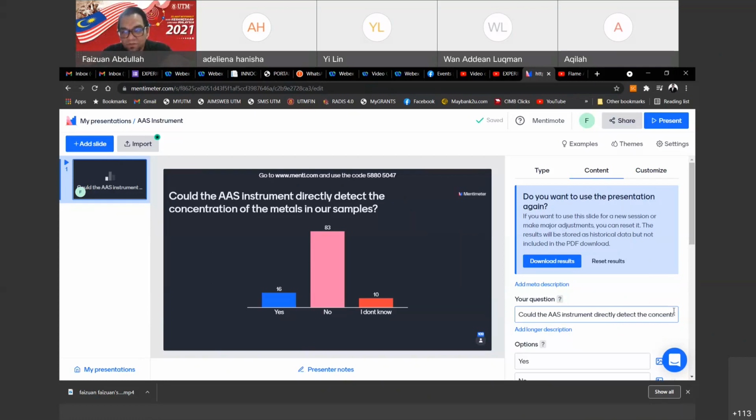Okay, that's what we were doing previously. We have shown you a video, right? The virtual lab video. I was preparing a series of calibration solutions of known concentration. We know the concentration, right? In the video, we told you we prepare 0.1, 0.2, 0.3, 0.4, 0.5 ppm.